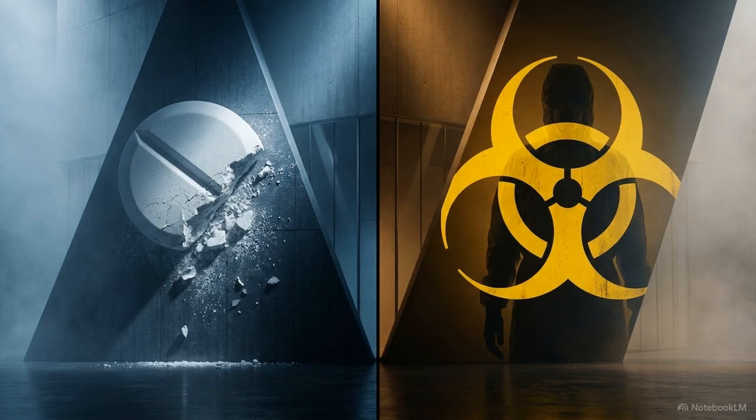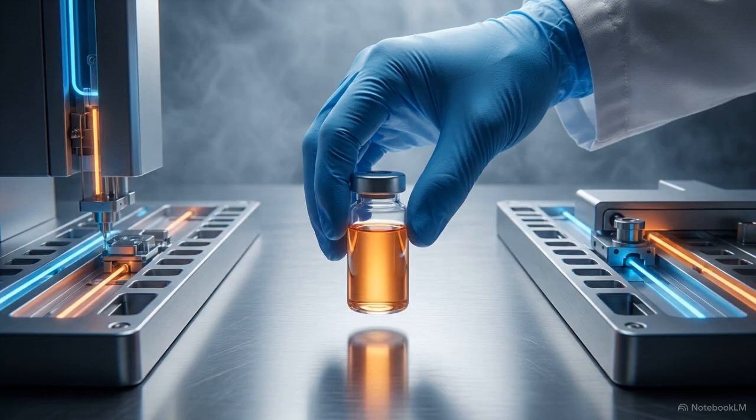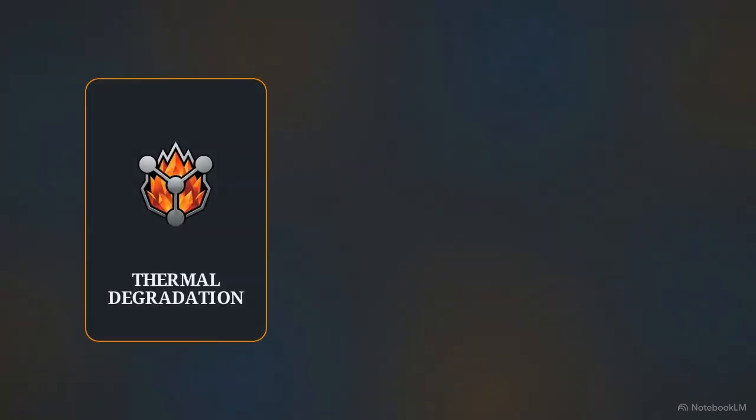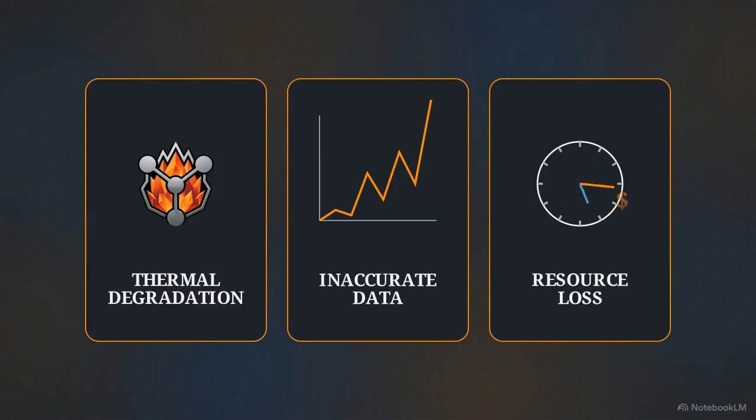If an active ingredient degrades or a toxic solvent goes unnoticed, patient safety is immediately compromised. To guarantee that safety, technicians rely on two cornerstone mass spectrometry topologies, LC-MS and GC-MS. But routing a sample to the wrong machine has immediate consequences. You risk destroying the sample through thermal degradation, pulling inaccurate data, and burning through expensive laboratory time.